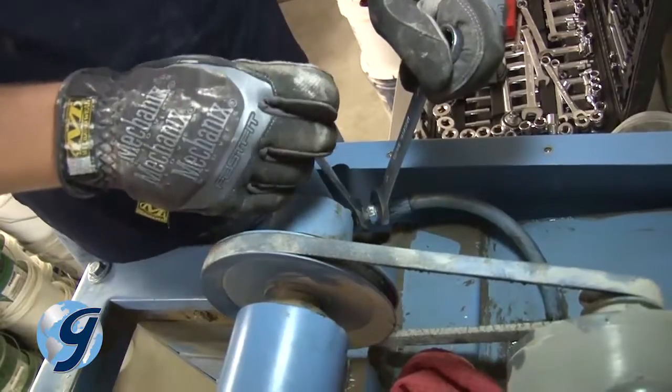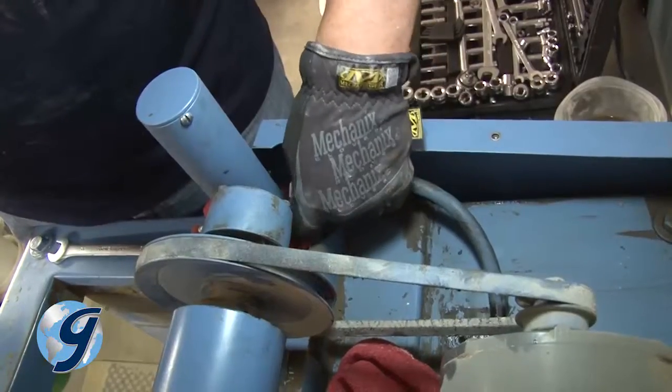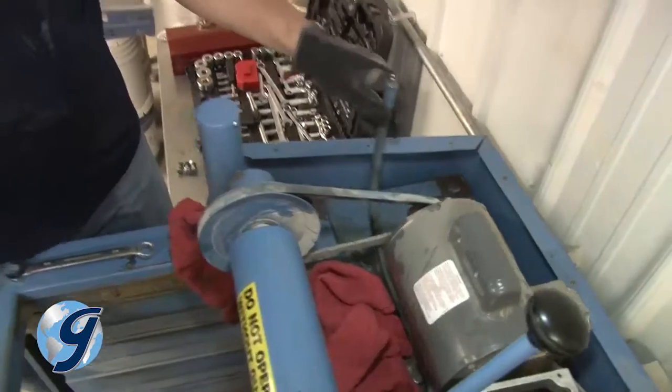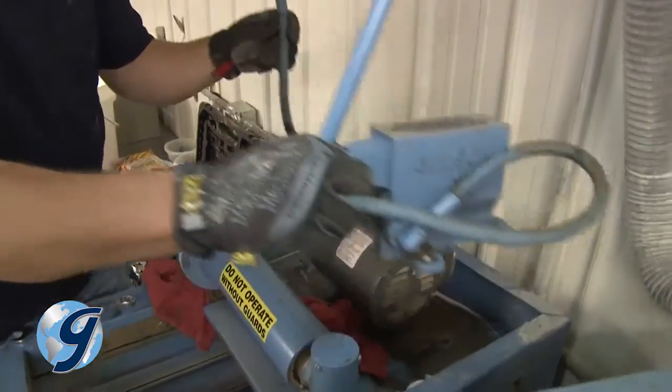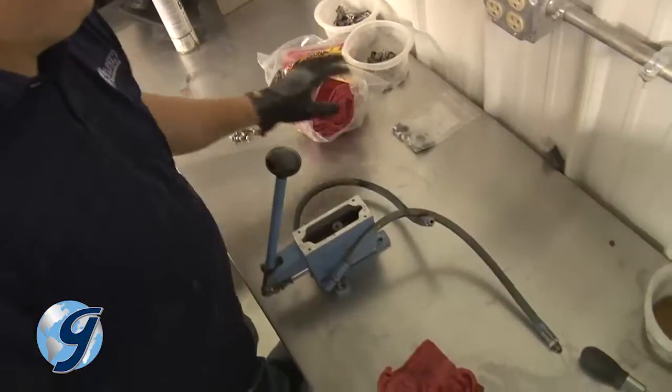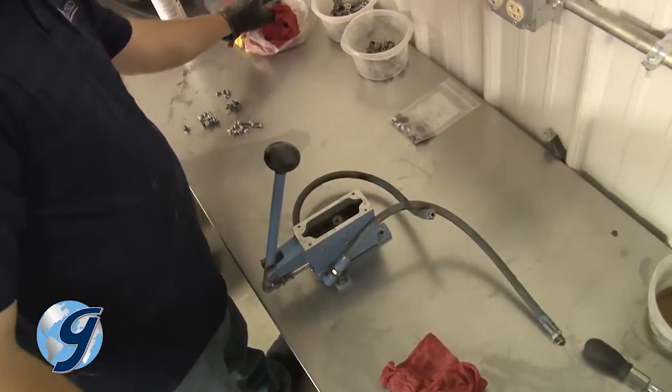Now disconnect the hydraulic hose fittings at the cylinders. Make sure that you have rags in place to minimize spillage of hydraulic fluid. Once the hydraulic lines have been removed, move the pump and hoses to a workbench or other solid clean area for further disassembly.